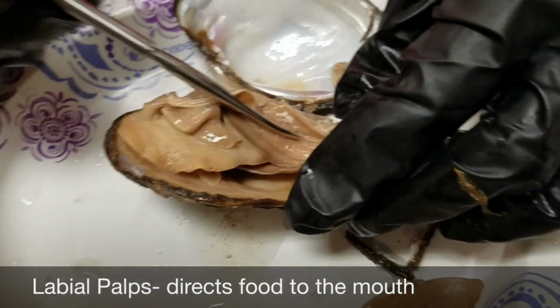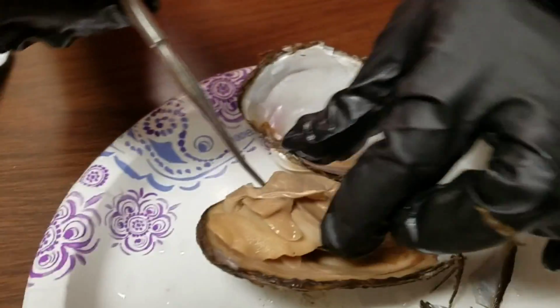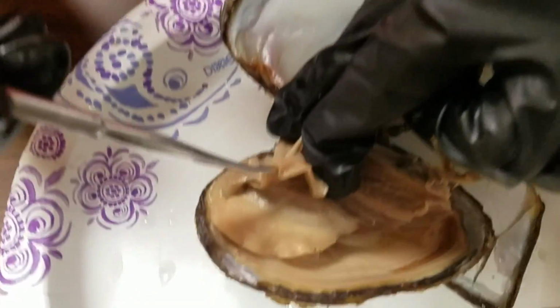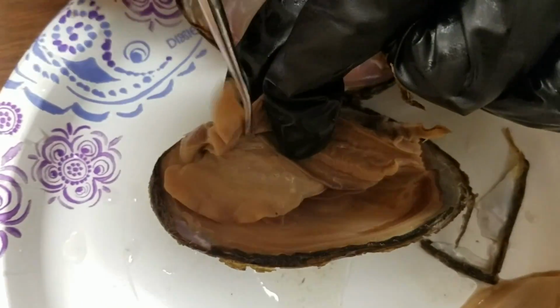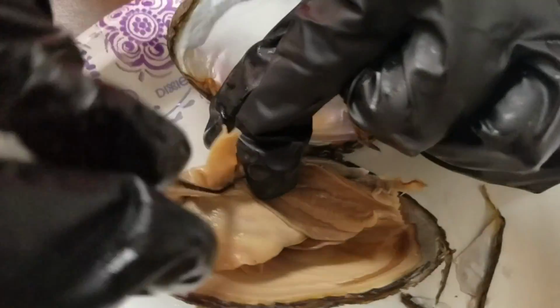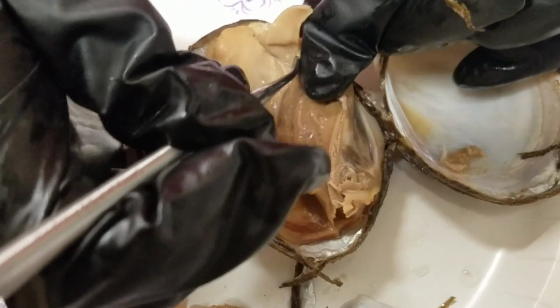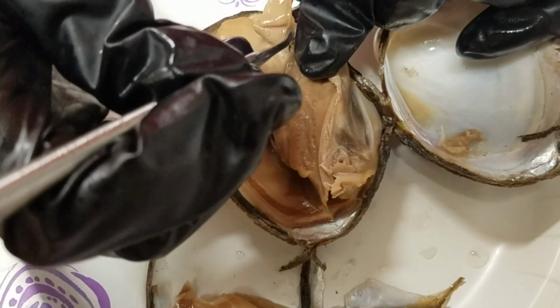It's going to trap plankton and other things along the gills, and then it's going to be kind of siphoned over to where the labial palps are. I'm going to try to find a mouth here. Right, I think we're making progress, maybe.